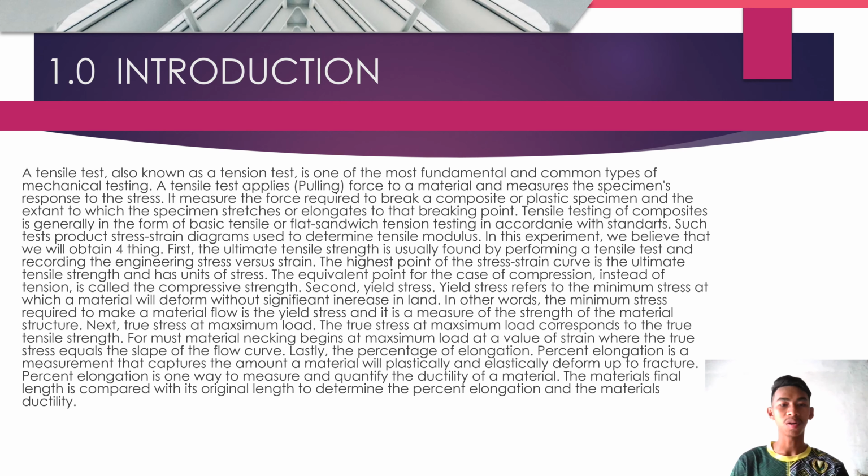A tensile test, also known as a tension test, is one of the most fundamental and common types of mechanical testing. A tensile test applies a pulling force to a material and measures the specimen's response to the stress. It measures the force required to pull a composite or plastic specimen and the extent to which the specimen stretches or elongates to the breaking point.